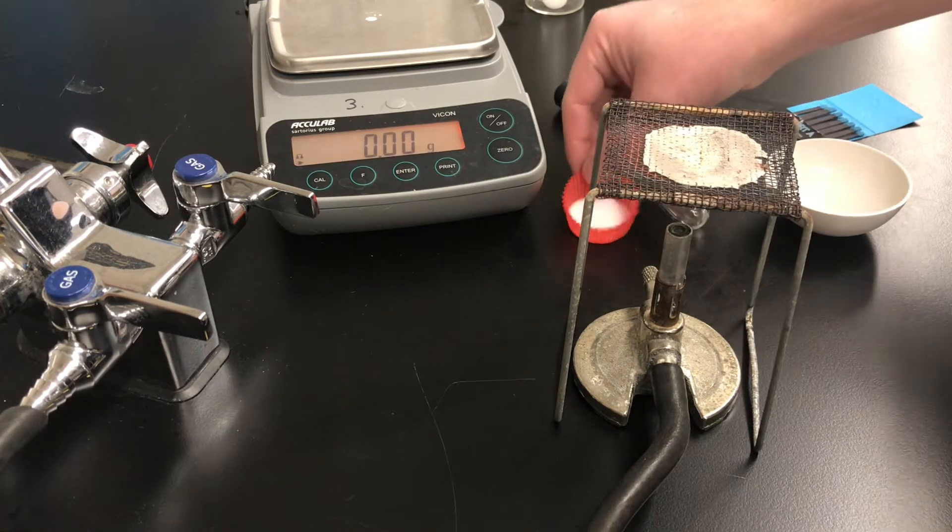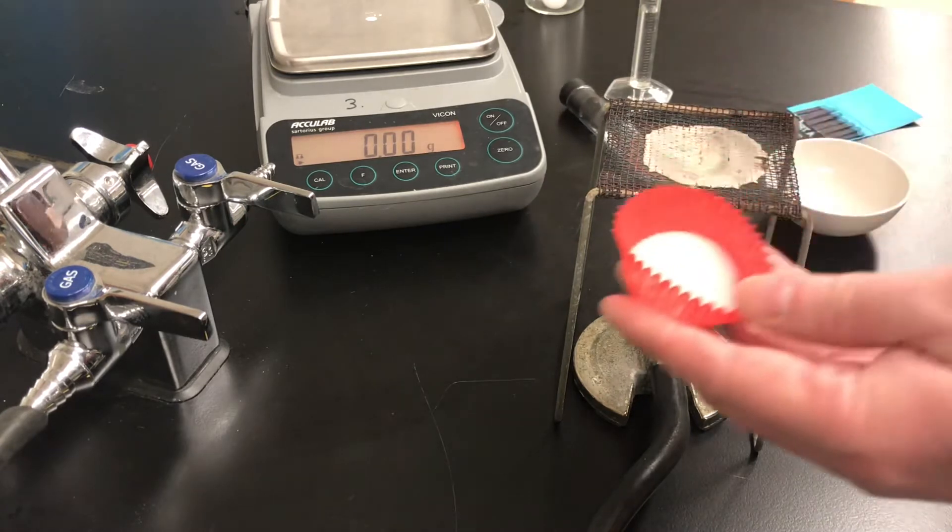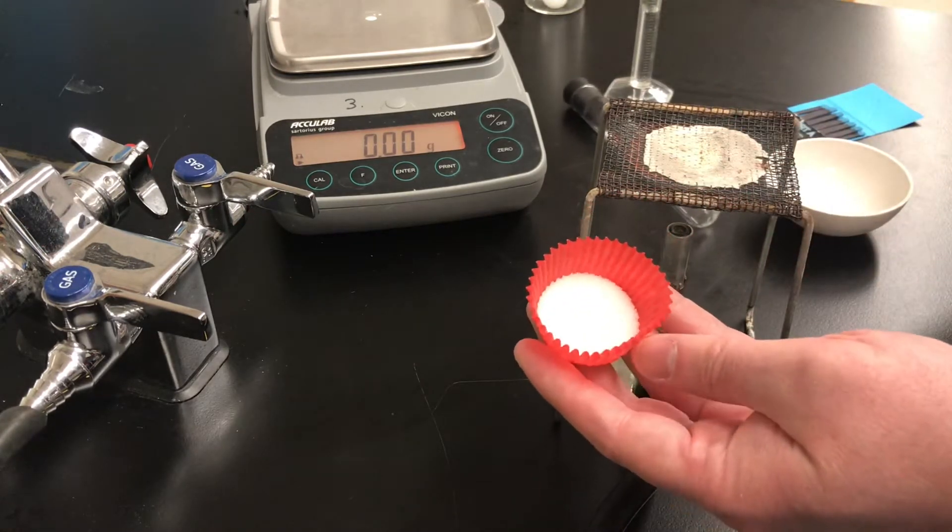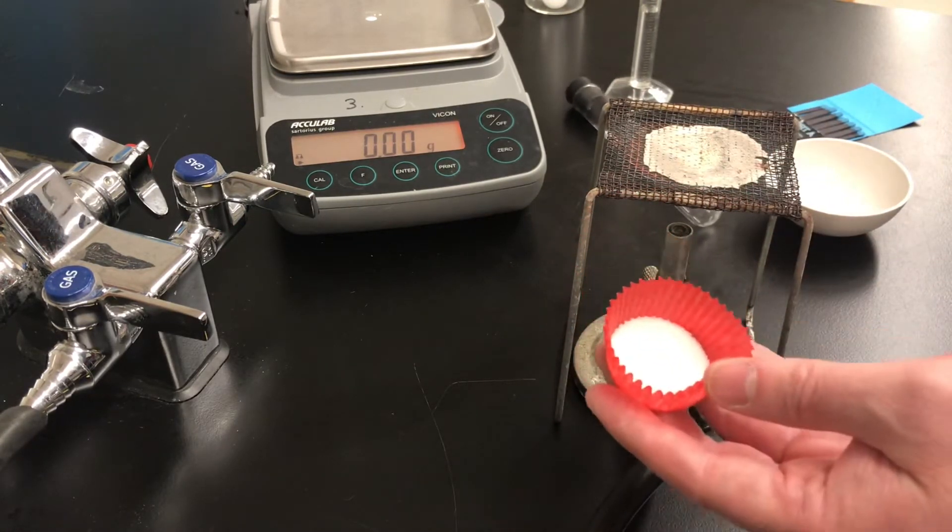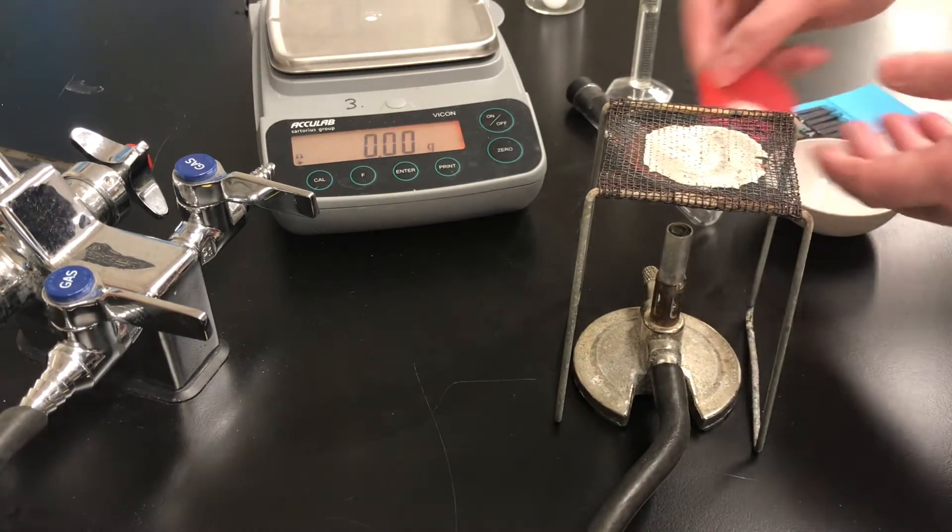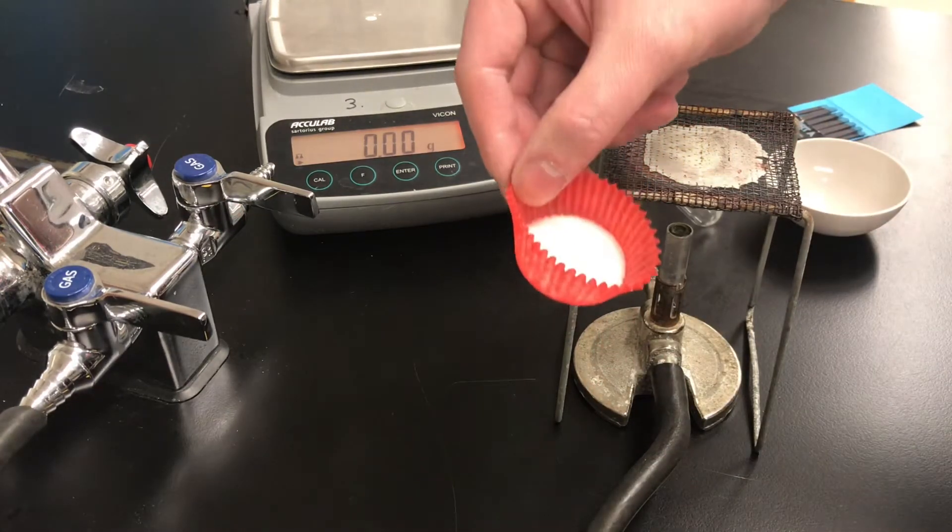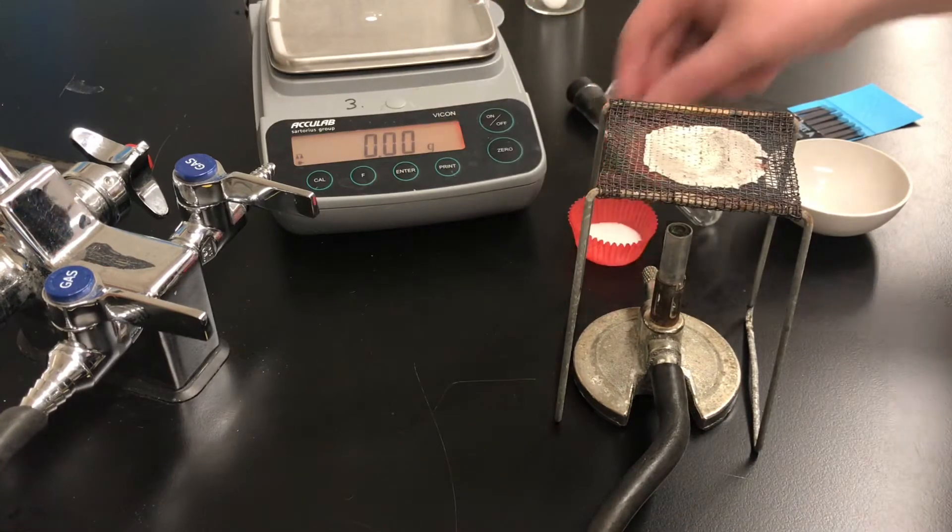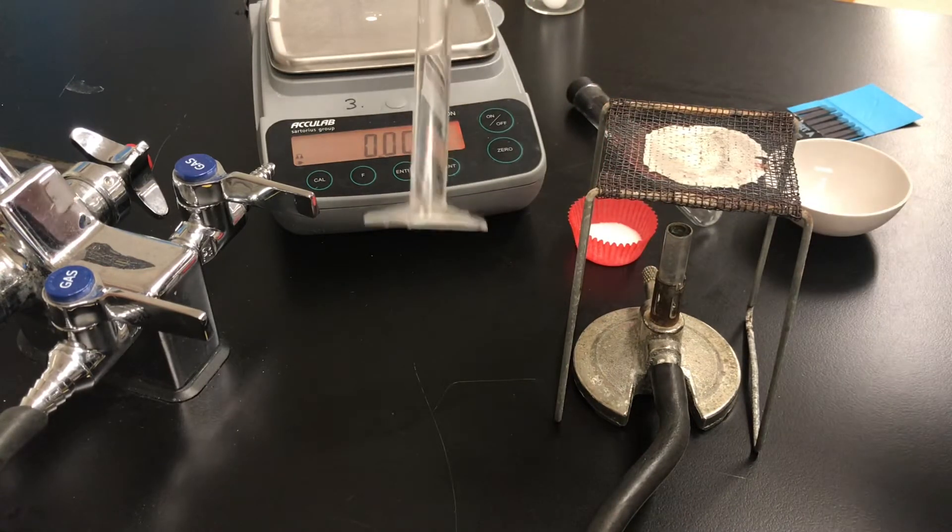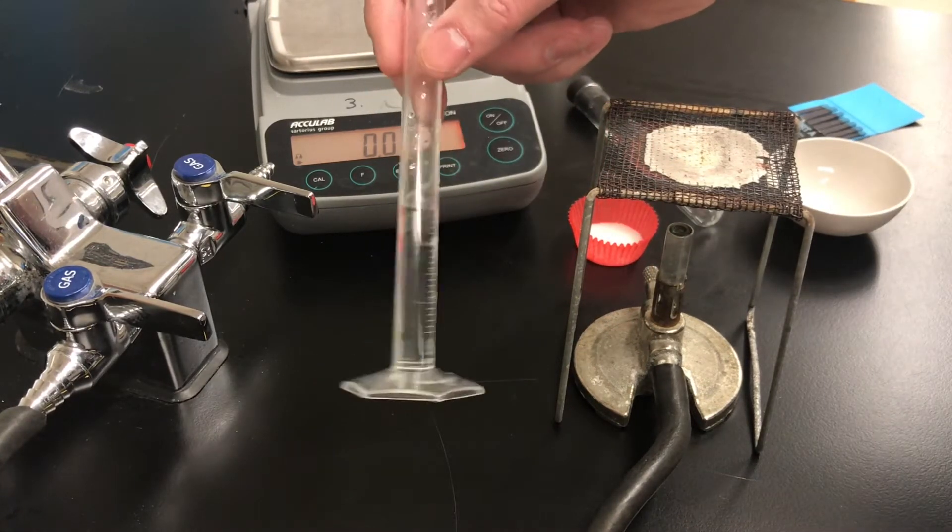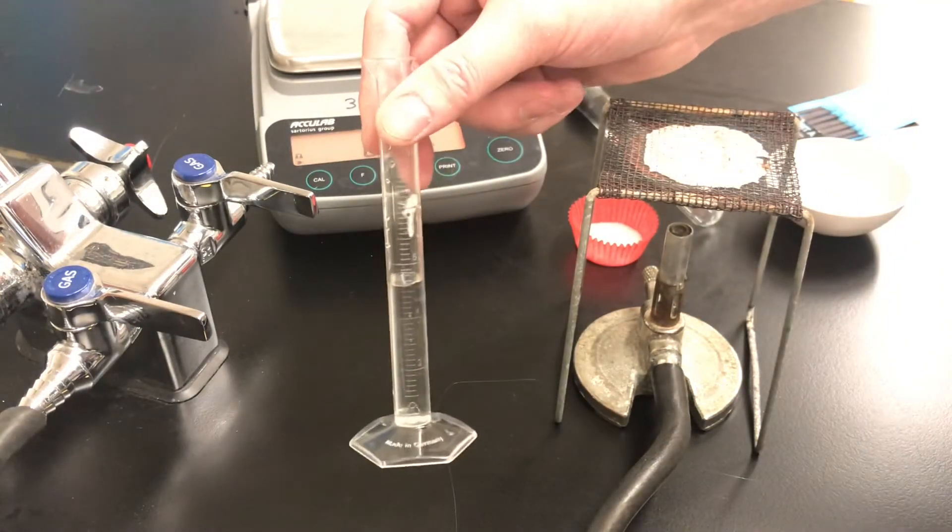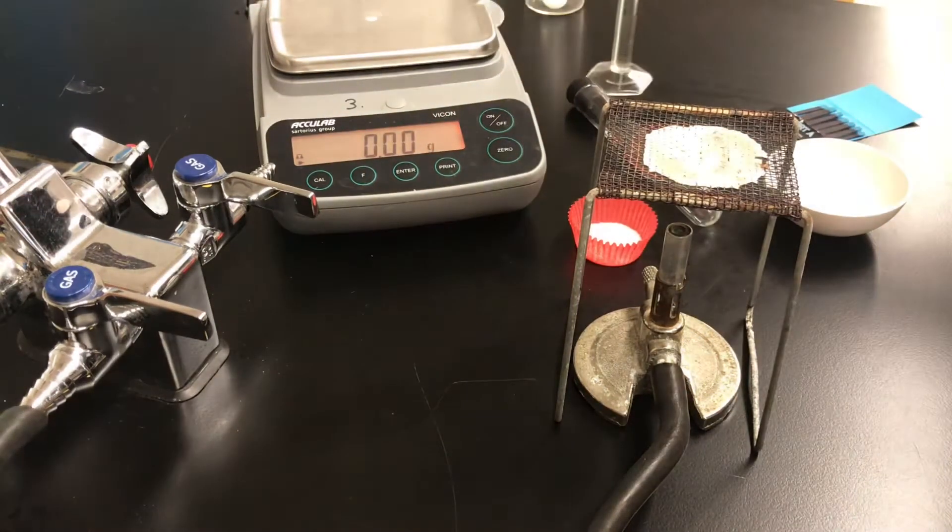We're going to be using sodium chloride table salt. This is the same salt you'd have in the kitchen although it's a little bit purer than what you would have at home. I've got about 5 grams of the table salt in a little cupcake. I've also got about 5 milliliters of water measured in a graduated cylinder. The exact volume is not critical.